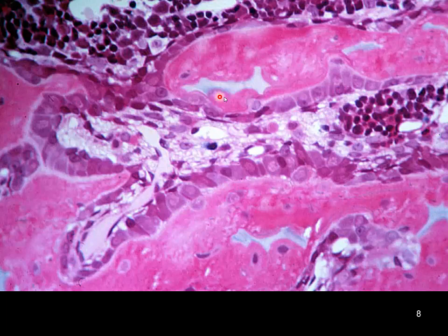Once again, we're looking at a cavity where we have our osteoblast adjacent to the bone. Nice white area of osteoid. Mostly we're looking at bone, but we do have some of that calcified cartilage that we can see in this location, our really tall osteoblasts, and then our osteocytes completely surrounded by bone matrix.